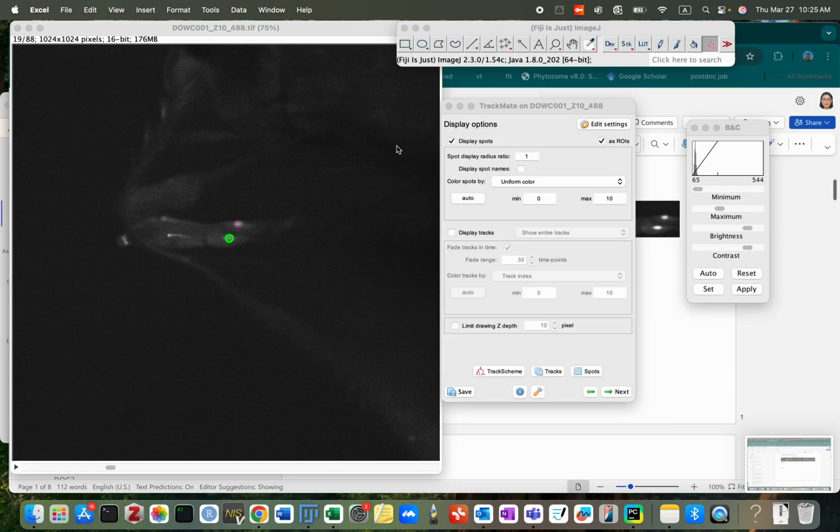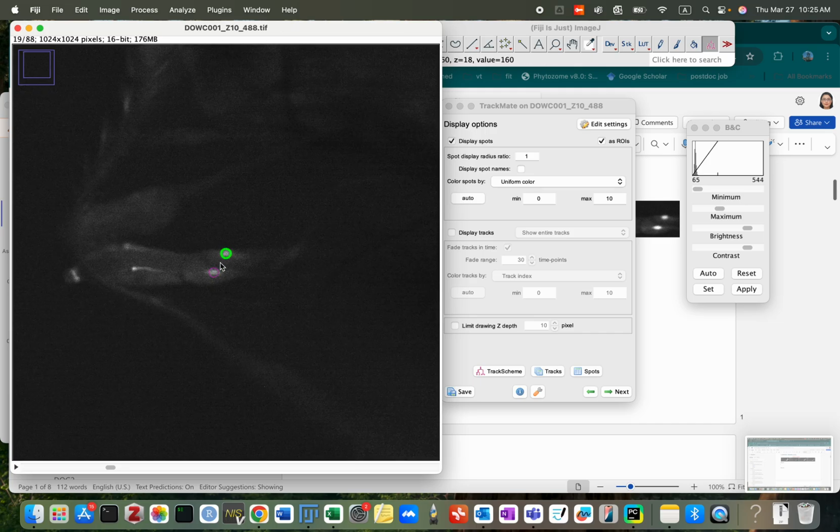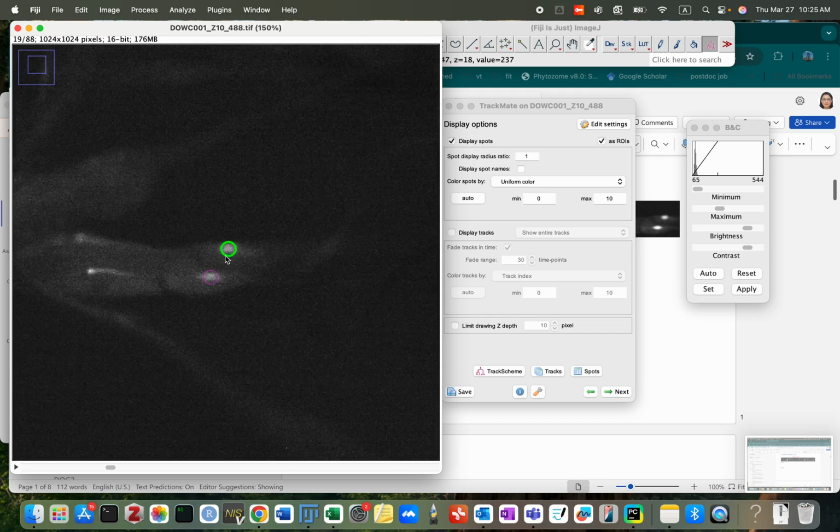Next, we need to get 5 backgrounds for neuron 0. Okay. I want to zoom. The shortcut for zoom is click the plus button, and your mouse should be nearby your cell with the area you want to zoom. Okay, now I need to draw a circle. So you select the circle button, you hold the shift on your keyboard, and you draw a circle which has the same diameter as your cell. Okay, I think my setting is 17. So you see it showing here, and then I place this not overlapping with my cell, but not too far, and I make sure it has no influence from our cell's fluorescence, but this is the background signal.